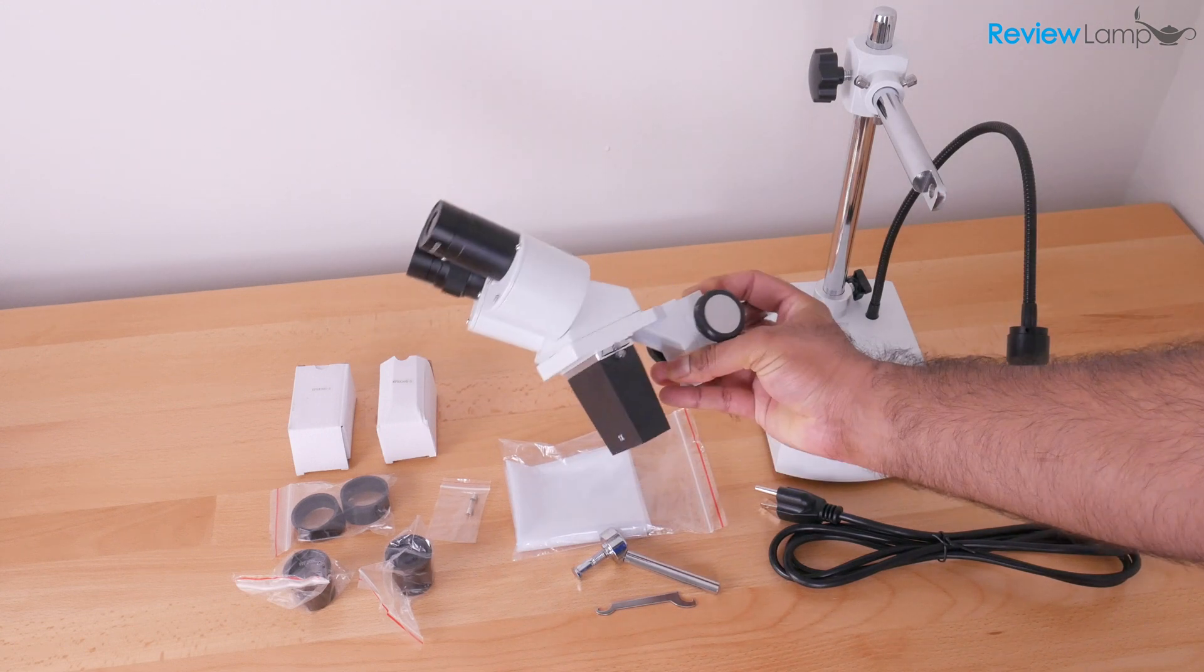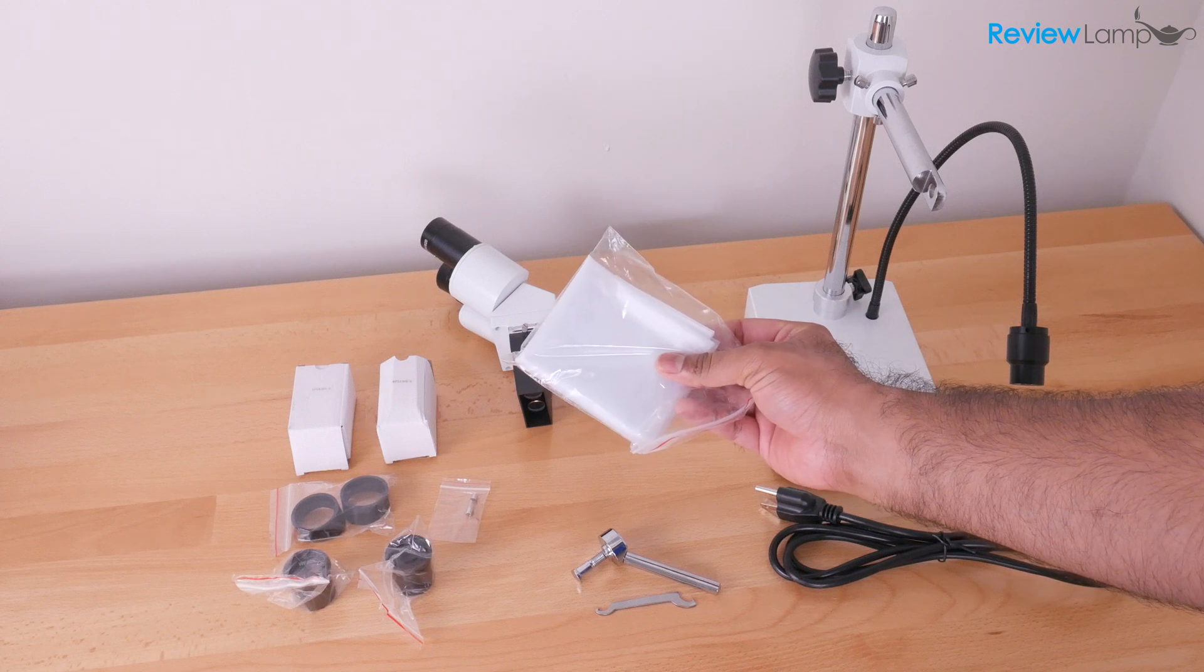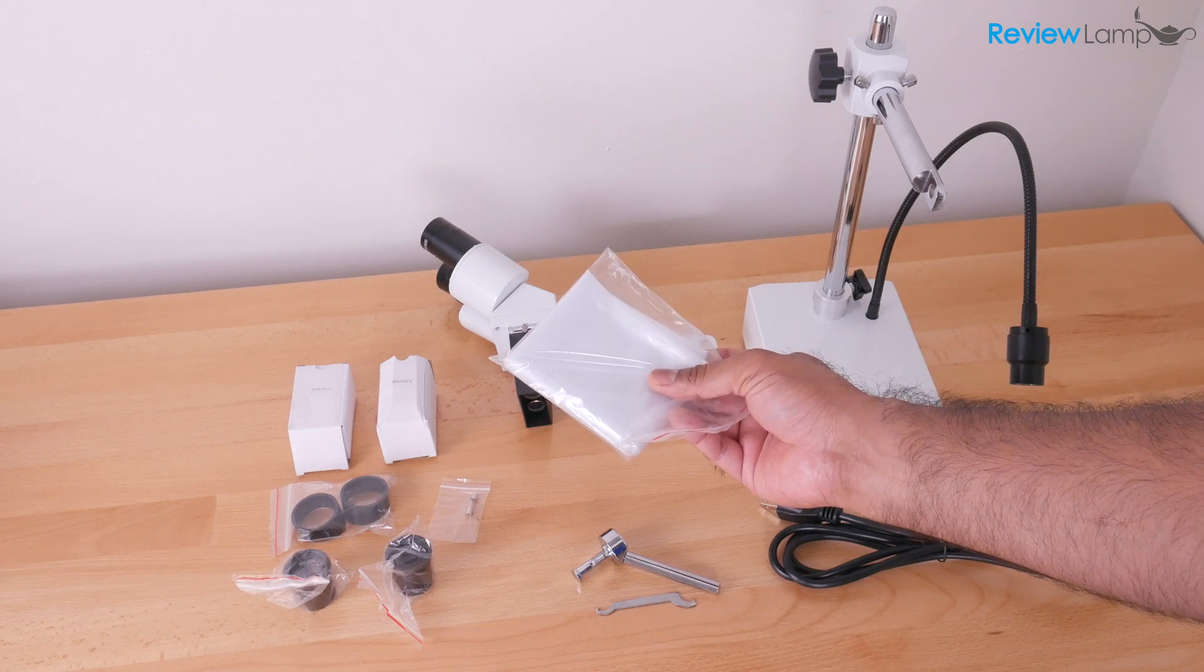Very importantly, you have the head of the microscope. You have a little dust cover, which you can open up and use to cover the microscope when you're not using it.